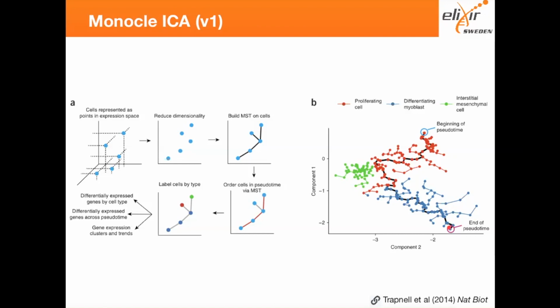What if you get not one minimum tree, but several possibilities? Yeah, that would be very unlikely, actually, unless you have two cells that are quite close together.